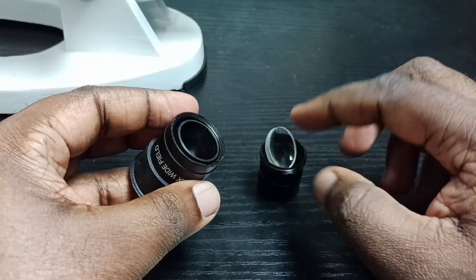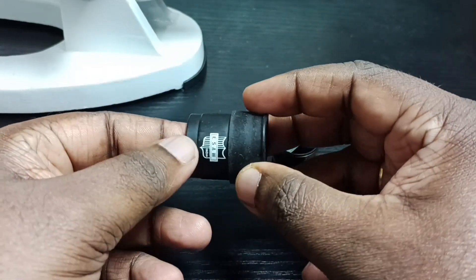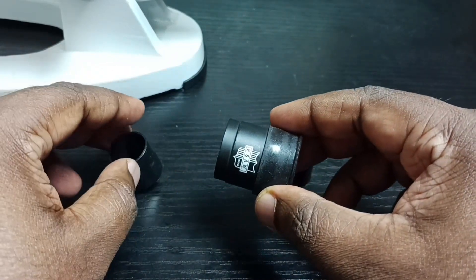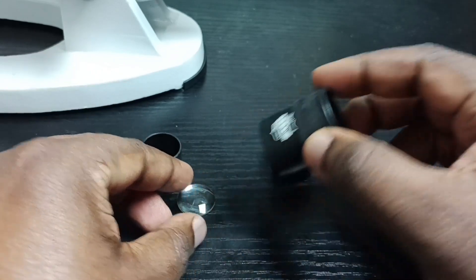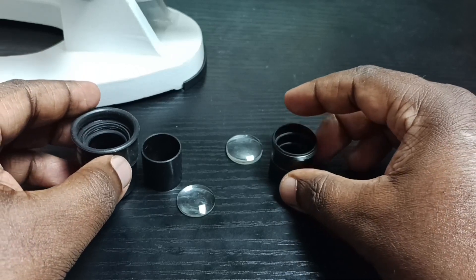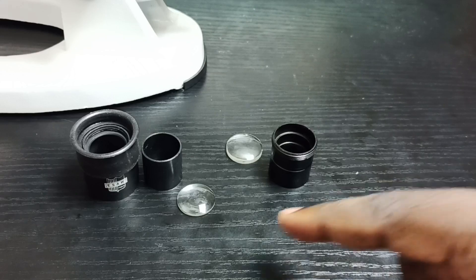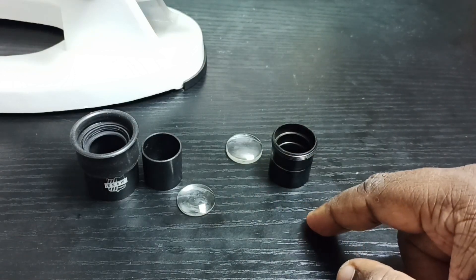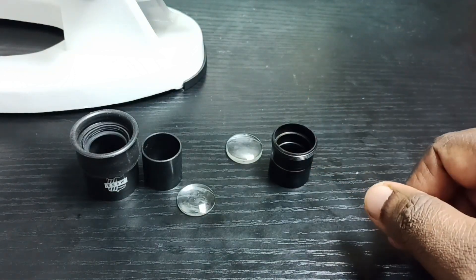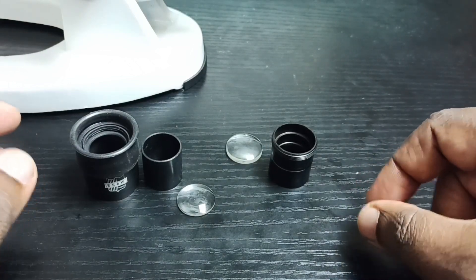This is one lens, and there is one more lens inside. Don't change these two lenses around. We can clean these lenses with some cloth, and after that let me show how we can put it back.